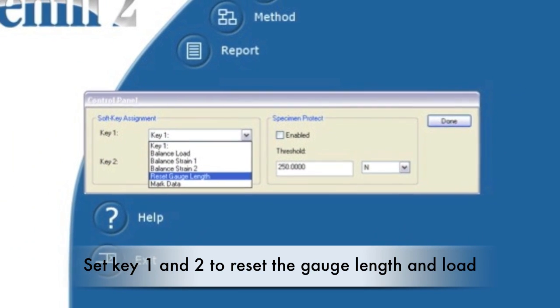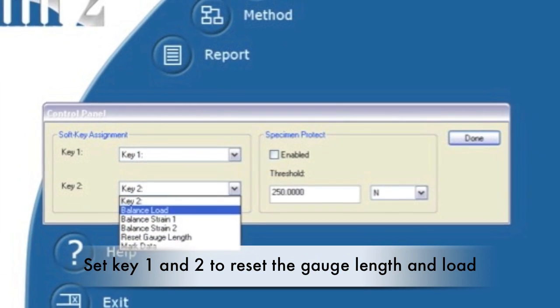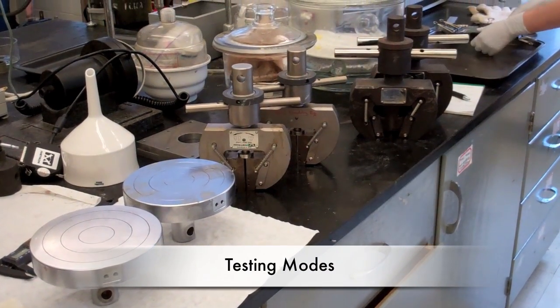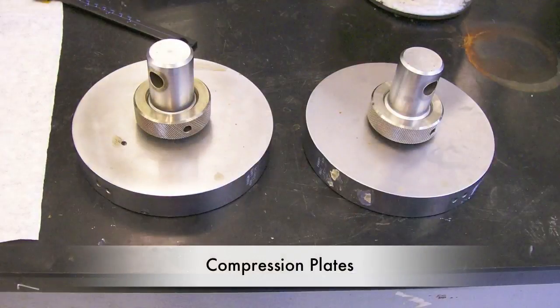Key 1 and key 2 can be assigned as reset gauge length and balance load respectively for ease of use. There are several types of testing modes. Compression plates use force to compact the sample.